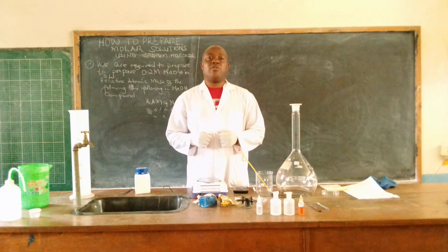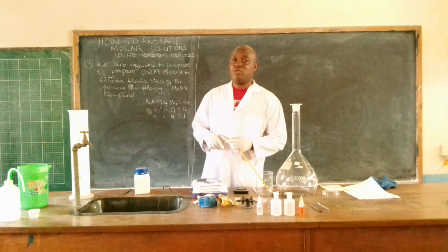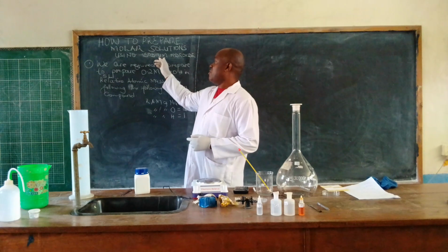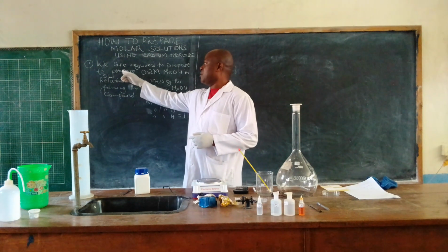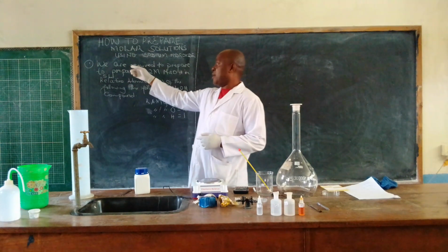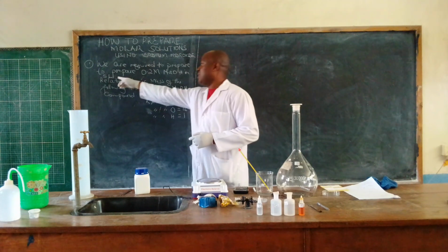Depending wherever you are sitting on the globe, today we are going to discuss how we can prepare another solution using sodium hydroxide. And we are going to know how we can prepare 0.2 molar sodium hydroxide in 5 liters.